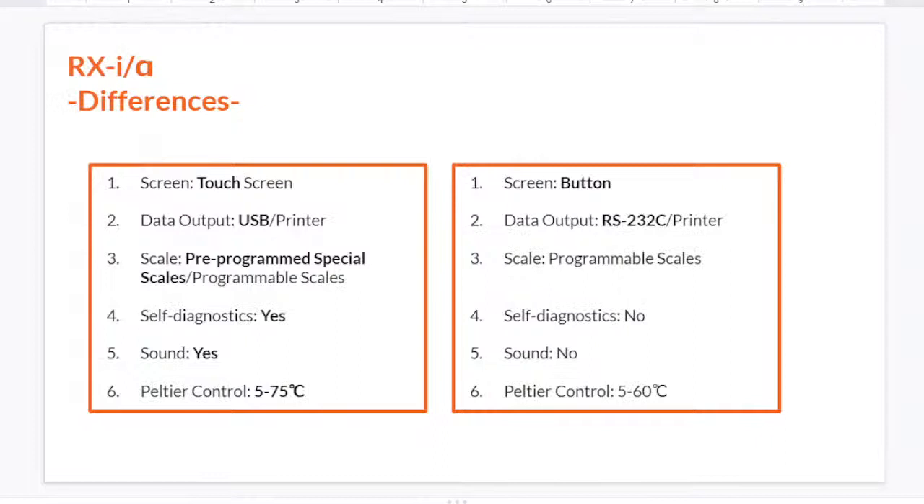Now let's move on to the differences between RxI and Rxα. First is screen style. RxI has a touchscreen — it's more like an iPhone-style interface. But with Rxα, you have to click buttons to move to different displays, which is more like an analog cell phone.